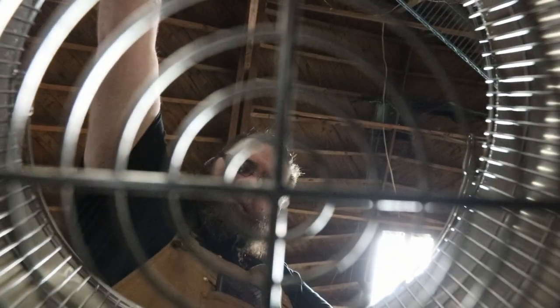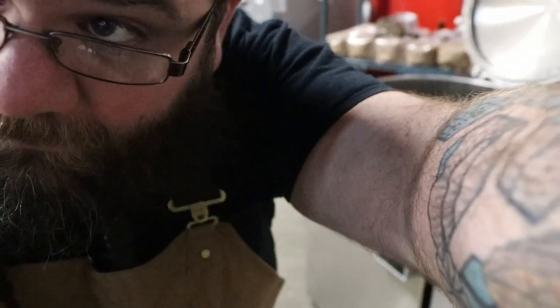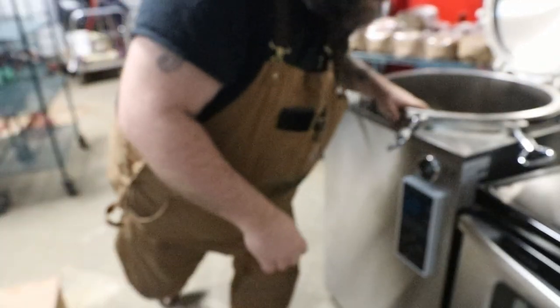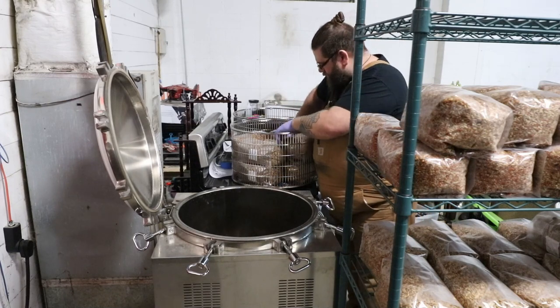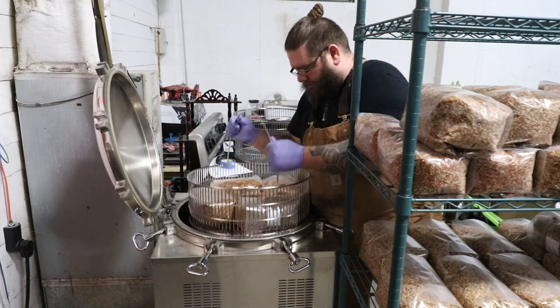Up next, let's just talk about autoclaves, shall we? This, my friends, is an autoclave. And this particular autoclave model comes from SH Scientific out of South Korea. I very purposely avoided a Chinese model. Not that I've used a Chinese model, I just figure why not support manufacturing elsewhere.